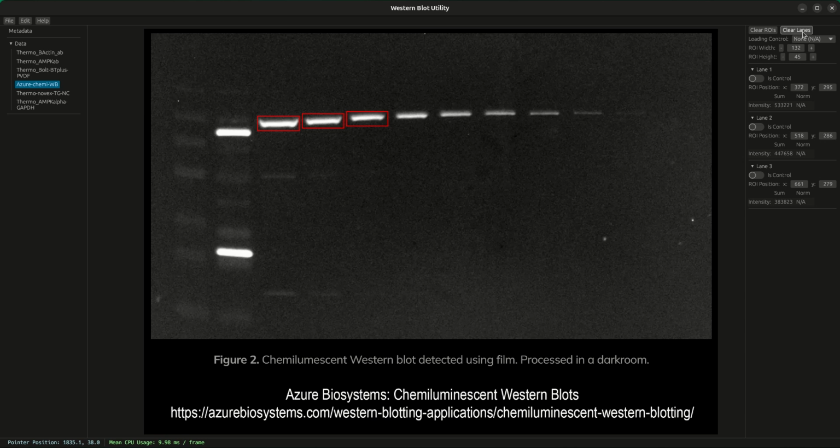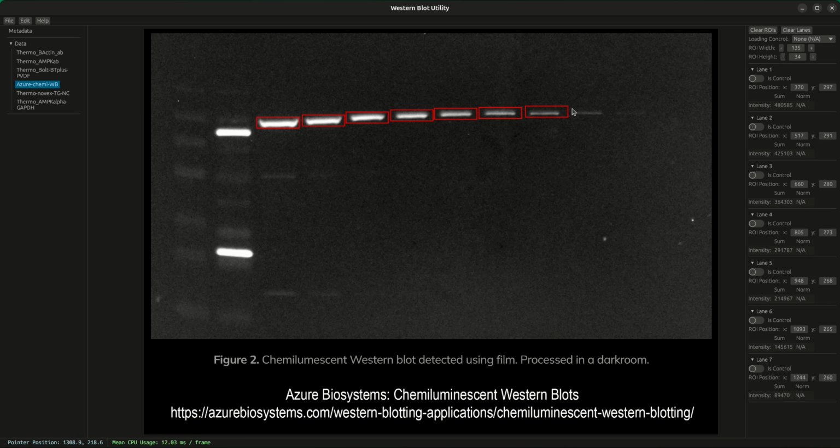So if I were to retry this, and I would, let's say, set this to 2, that's a huge change, but let's say I double the height of this ROI when I do my cropping, you'll see it goes much further down the pipeline. And once again here, these bands are really hard to tell the difference from background, so you have to manually select them.